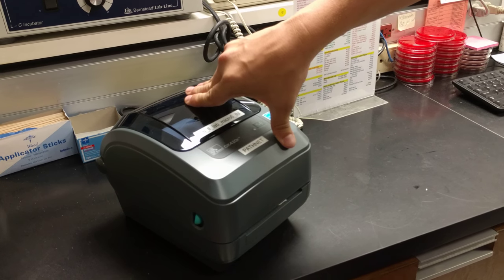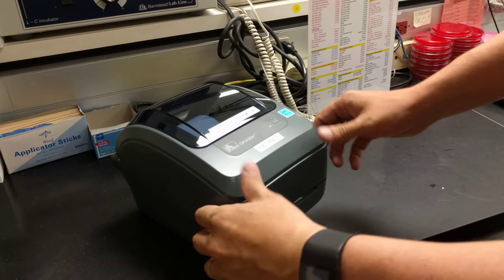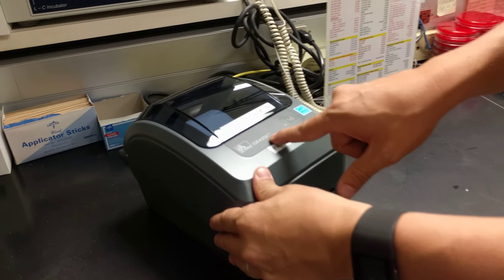This is how to change your ribbon on the micro printer for PathNet. It should say GK420T on the printer.